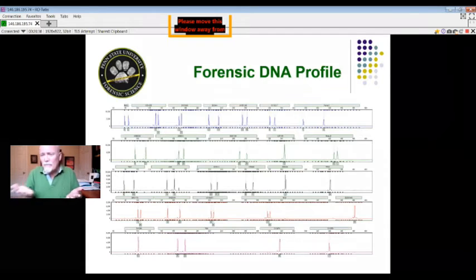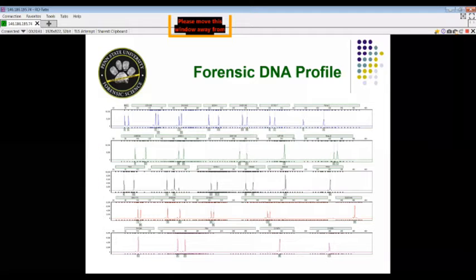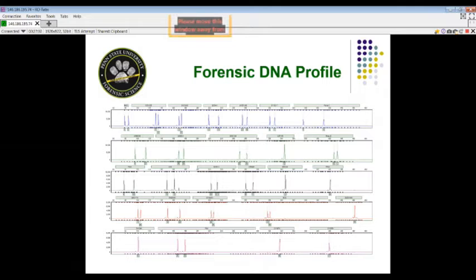And this is what a forensic DNA profile then looks like. As we look at it, if we just look at the macro view, there are some blue peaks or spikes. They look like spikes. These are just the bands of DNA that you saw in the gel, but instead of viewing them as bands, the relative intensity of those bands is converted into a peak. So these are just bands of DNA across a blue channel where we have blue light.